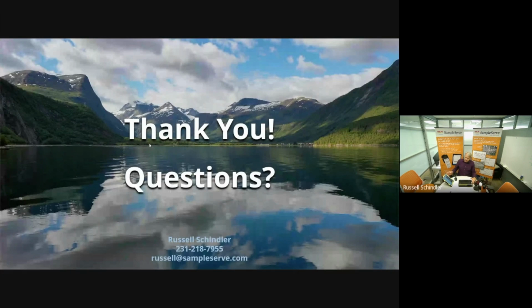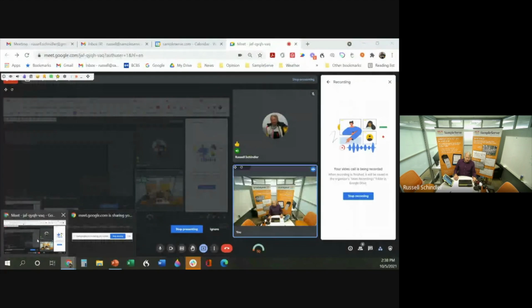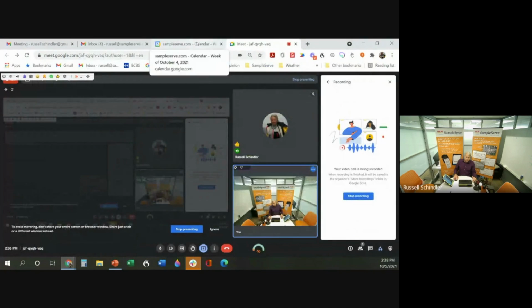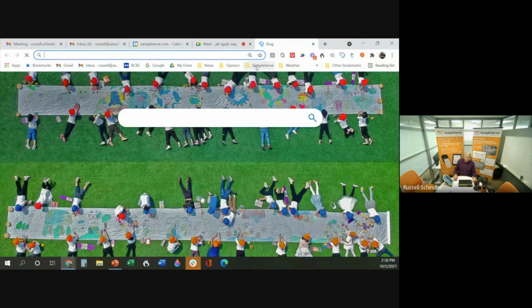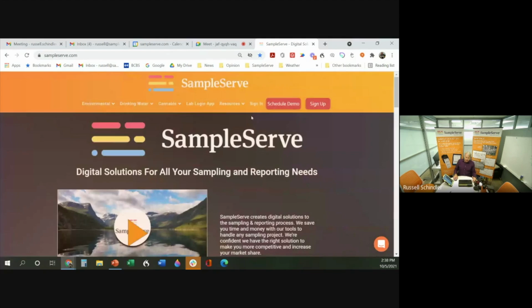I can actually demonstrate the mobile app now a little bit. Actually, let me demonstrate the project management tool for you. Let me pull up our project management. Should have had this opened already and signed in, but I didn't.